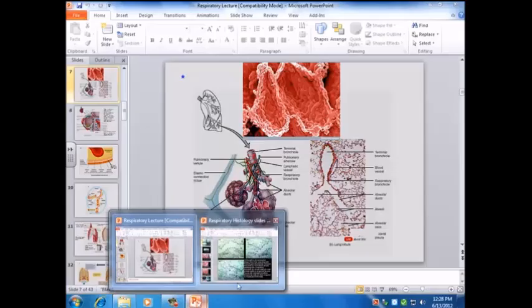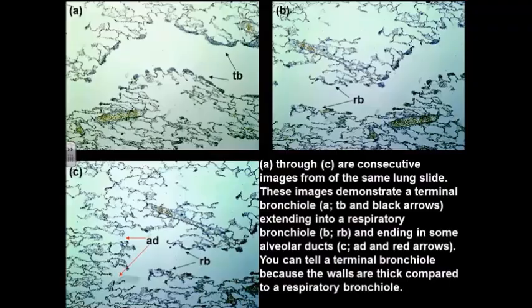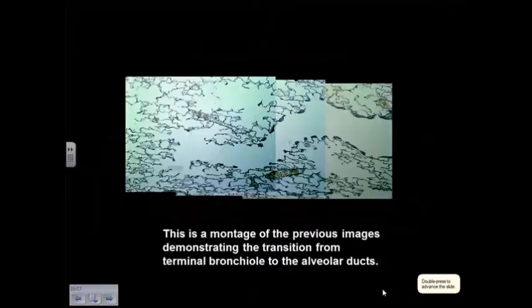So let's get back to the histology so we can complete this for the sake of completion, nothing else, at this point. So here's some nice blood vessels, and this is a montage of the previous images.